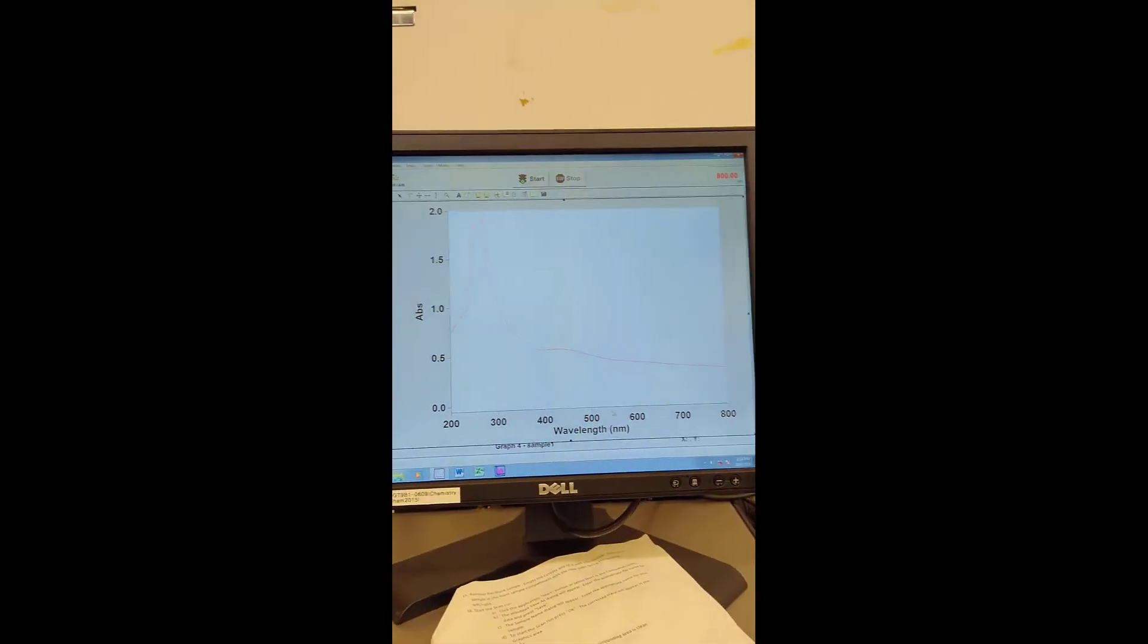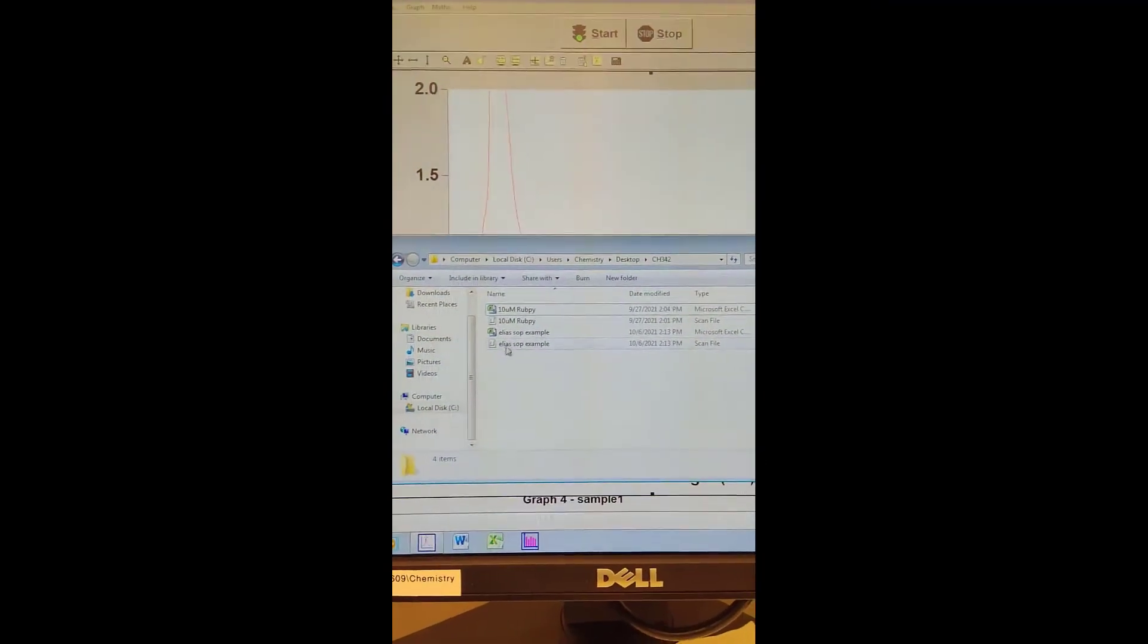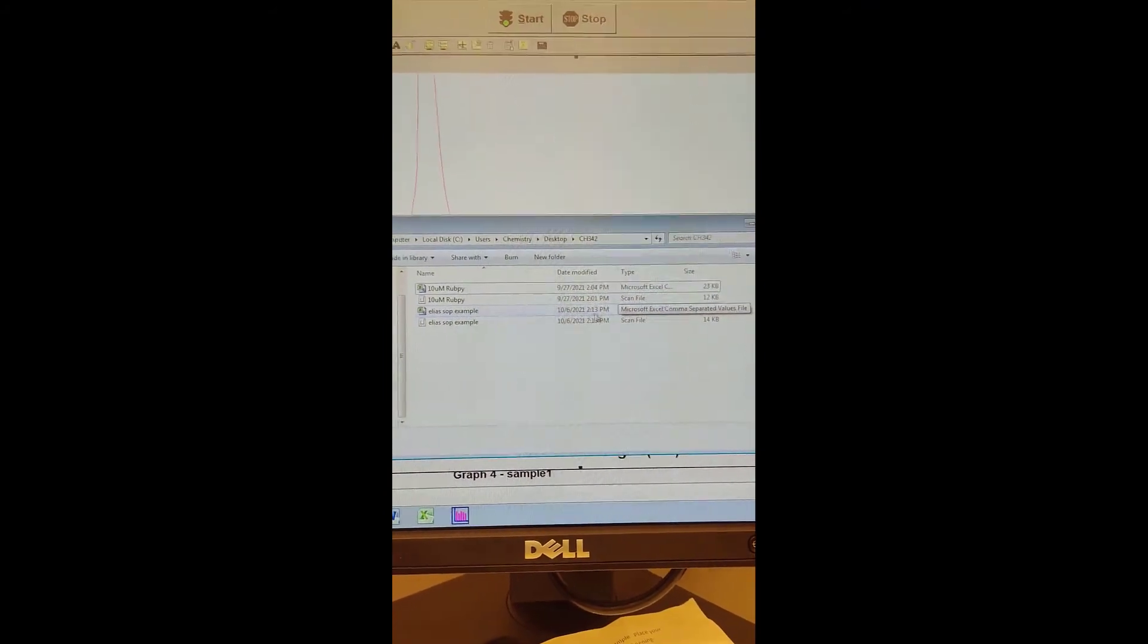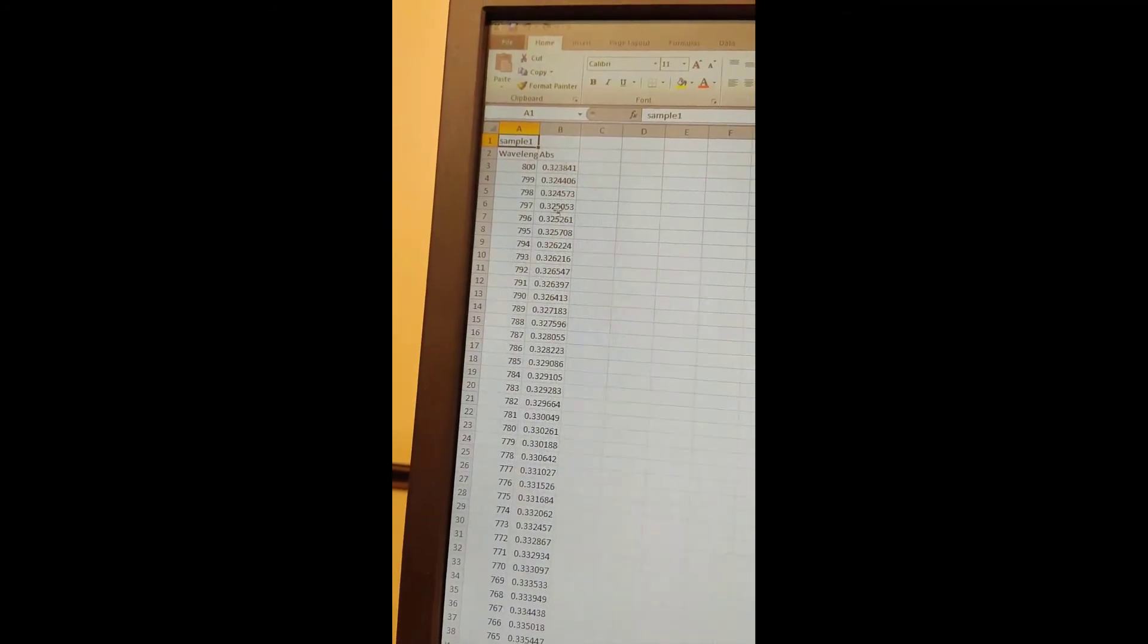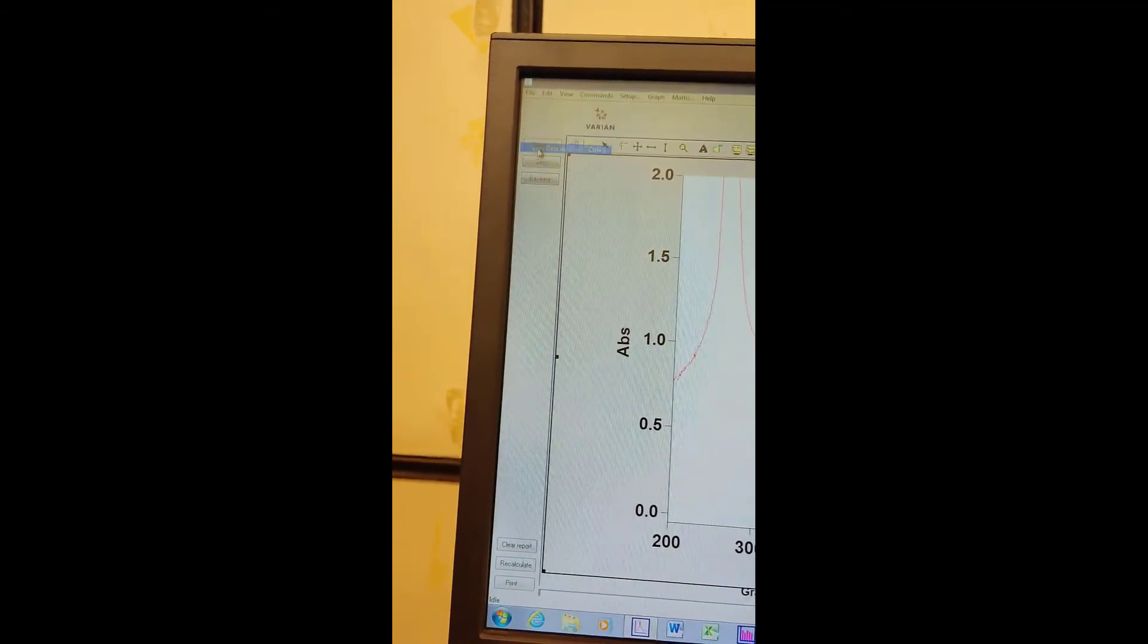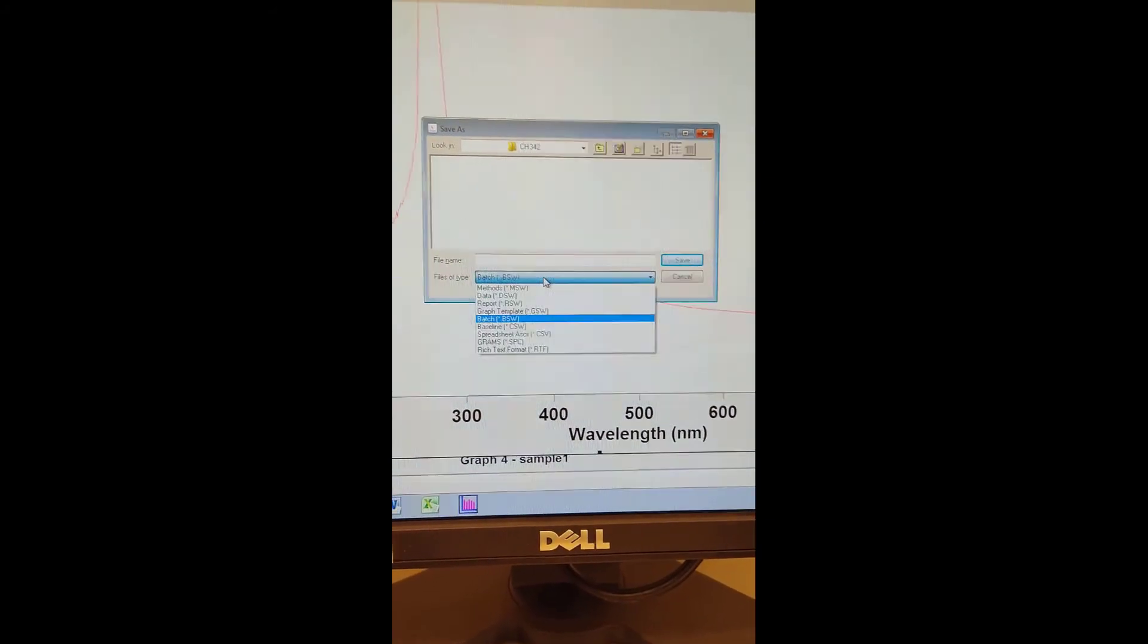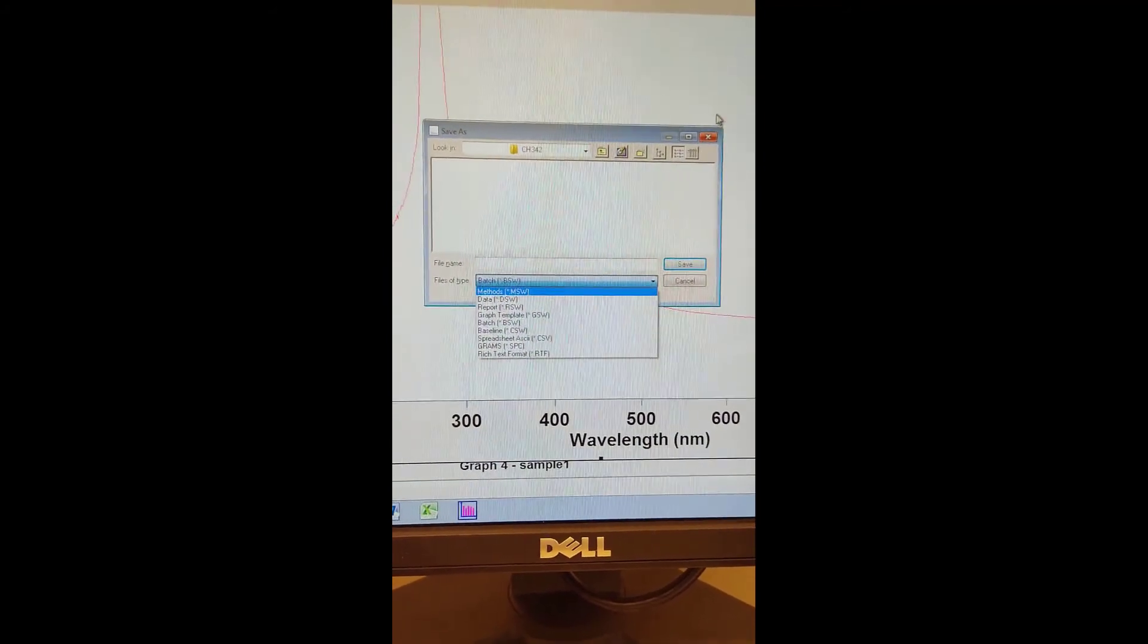Once the spectrum is collected, you can make sure it's saved into the correct folder. Since we selected this at the beginning when setting up our method, we also generated a CSV file in addition to the raw data file. That's really convenient because it spits out the data in an easy way to process later. Alternatively, you could save the data manually. Make sure you're saving it both as a raw data DSW file and a CSV file.